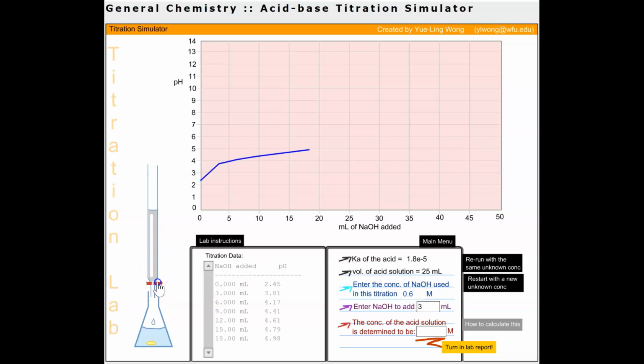And so let's run it. Now we have our steep inflection at approximately 30, which is right in the middle, which is nice. This is what I'm looking for. So I'm going to finish this curve. Now this curve doesn't look that great. So what I'm going to do is I'm going to make this look a lot nicer by manipulating the volume.